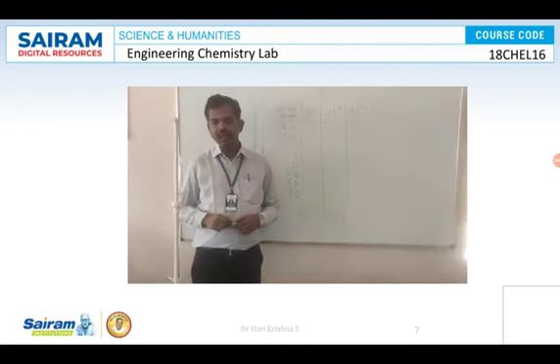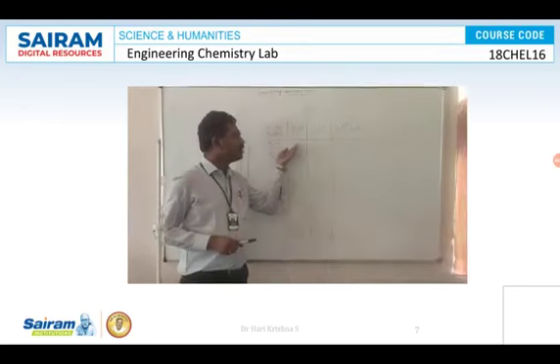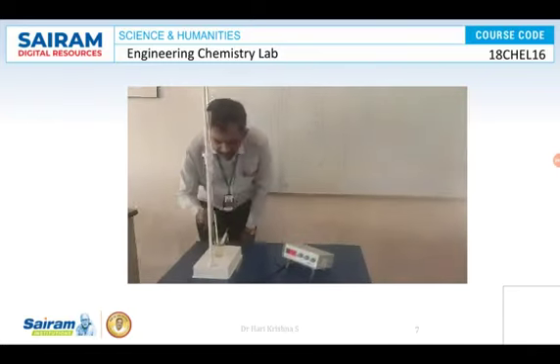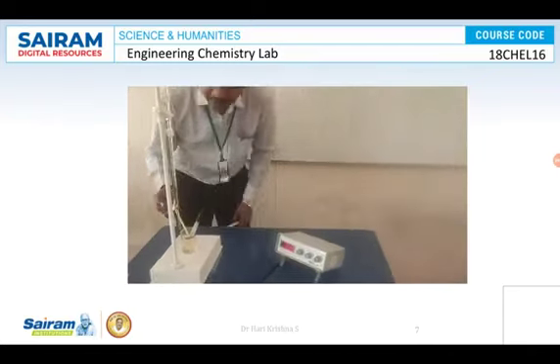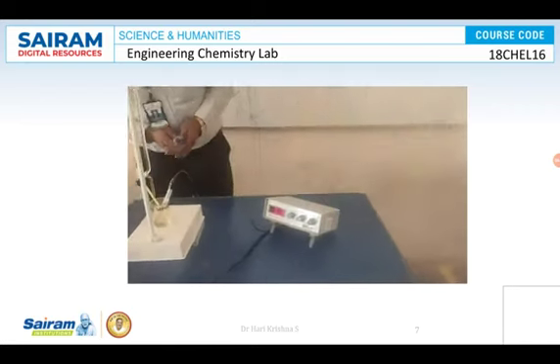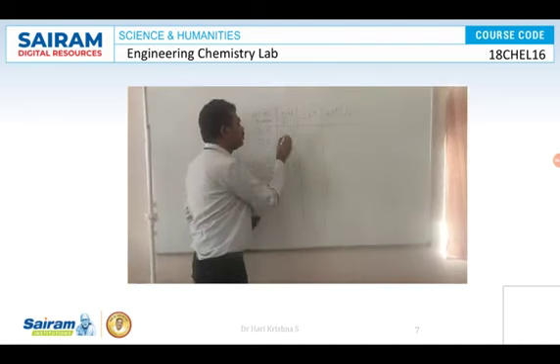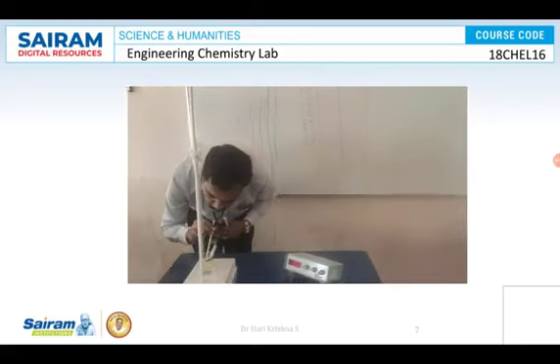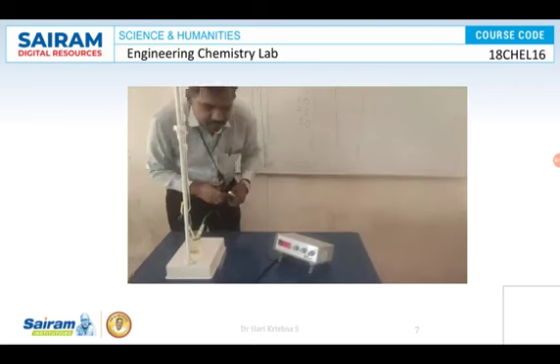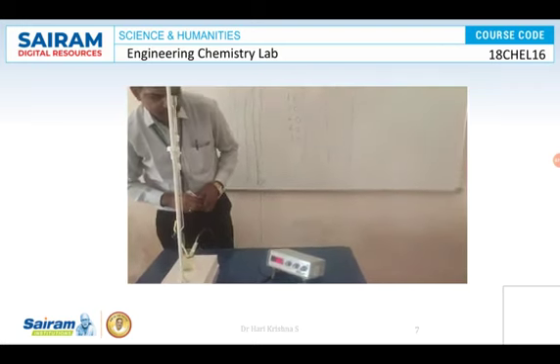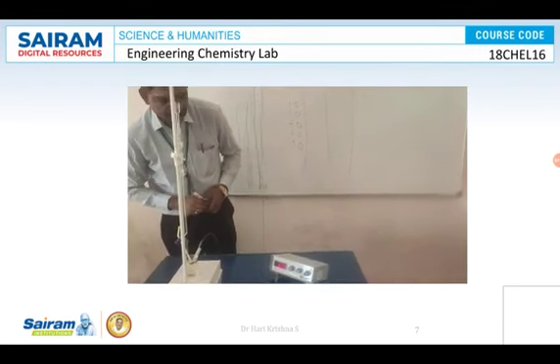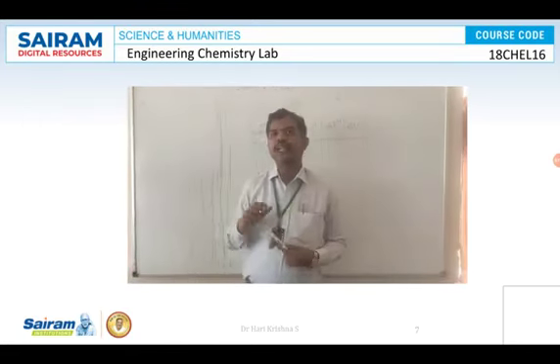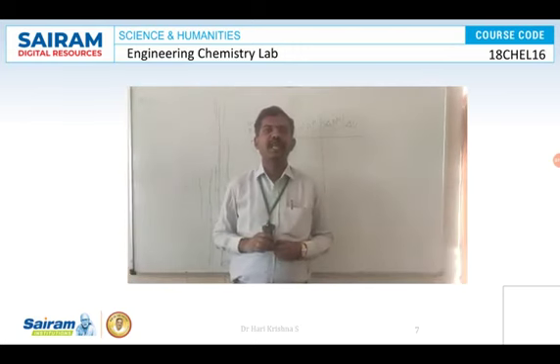We are going to add NaOH in increments of 0.5 ml. I am taking 25 ml of the weak acid here; before adding NaOH the reading is around 2.1. We will add 0.5 ml at a time and the pH will increase slowly. We continue adding in increments of 0.5 ml until there is a sudden jump in pH. Once the sudden jump occurs, we take 4 more readings and stop the experiment.